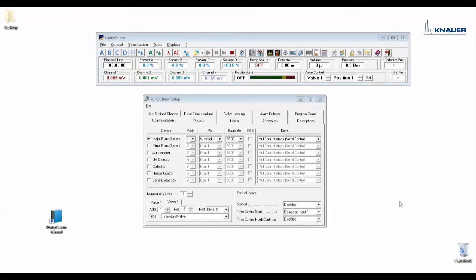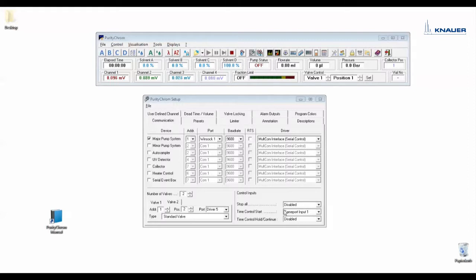Under control inputs you can program a special action depending on a signal from a trigger cable using a manual injection valve or from a game port adapter using the air sensor. For a signal from a trigger cable you have to choose event box input 1.